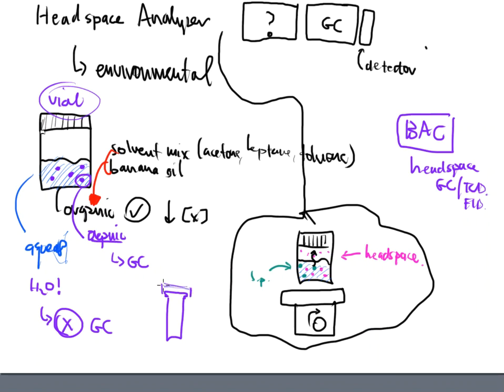And this cap is going to have to be crimped because, listen, we're heating this stuff up and we're increasing the pressure of the vial. So these lids have to be super tight. A screw-on lid is not going to work out for us too well. So we have to make that next step, and we have to ensure that these things can pressurize and are not going to blow their tops, literally, because if the lid of the vial goes off, then all of our sample goes off with it.